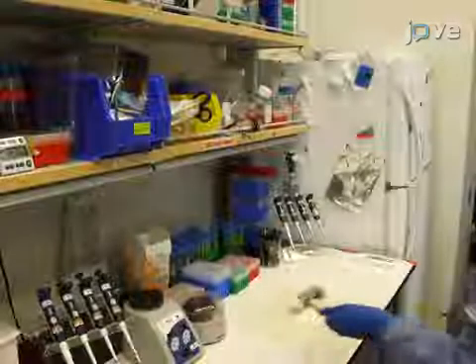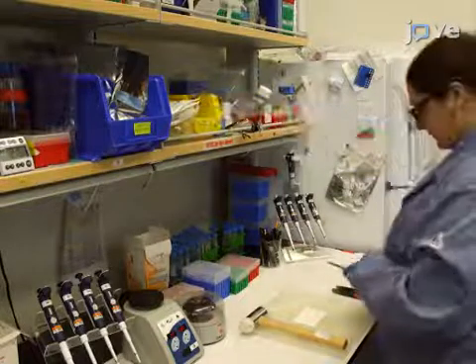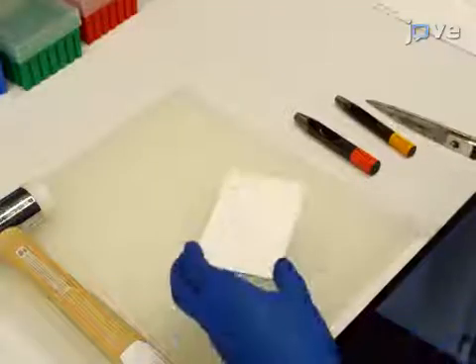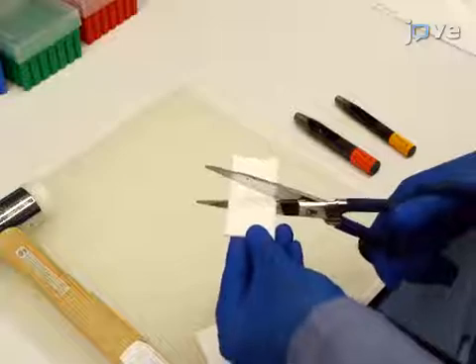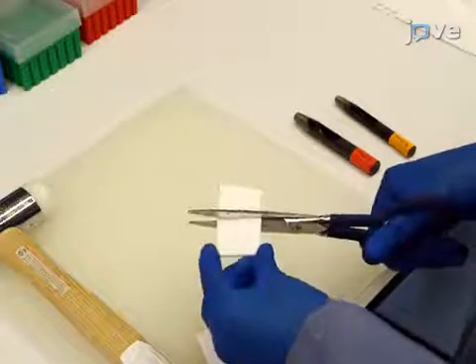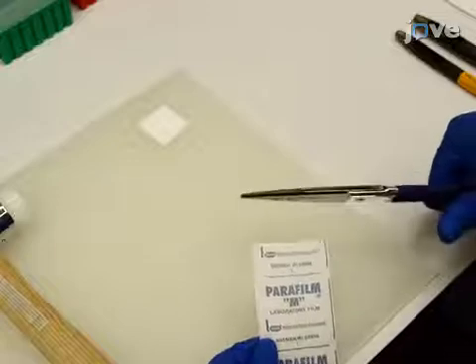Begin this procedure by preparing the materials needed for assembling the FINA sample preparation module. Prepare the blotting pad by cutting a 35 x 35 mm square of a 2.6 mm thick 100% cotton pad. Prepare plastic paraffin film with a paper backing tape.